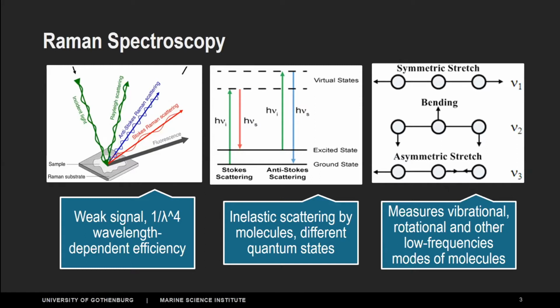So yeah, it's an inelastic scattering. And you see, you send one photon that has a specific energy and the molecule starts to react, it starts dancing because of that energy, and it's excited and it sends you another photon back, and that we register as a Raman scattering. And of course, the wavelength is shifted. So you send a lower wavelength and you get a higher wavelength.